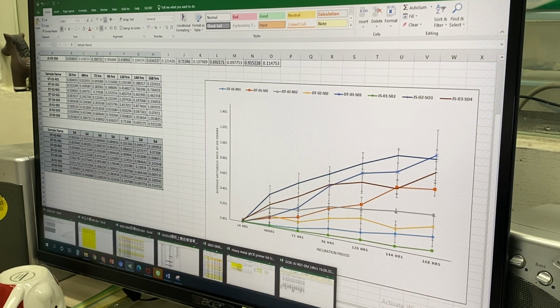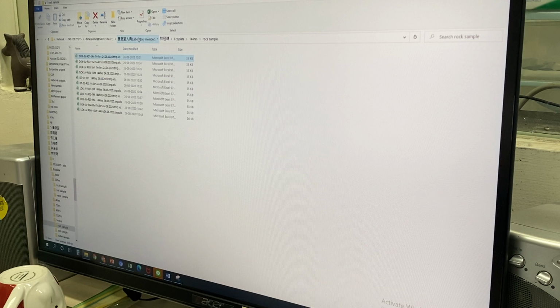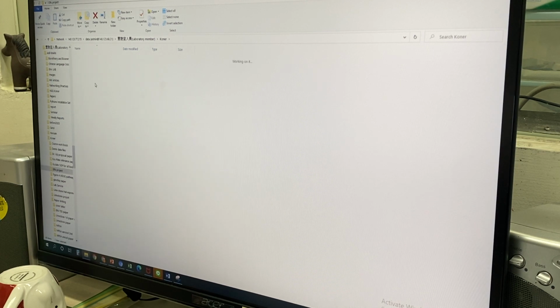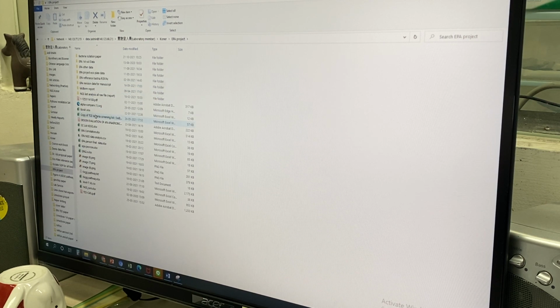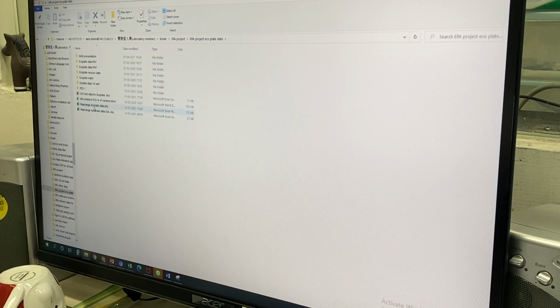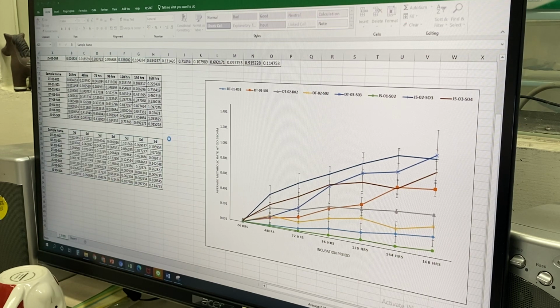So I give some example from my side, okay? So I calculate the 168 hours.